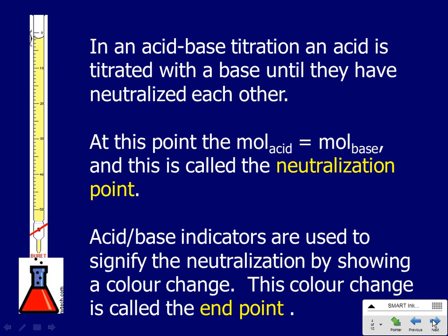Day two, we're going to take that sodium hydroxide that we now have standardized and calculated its concentration very well, and we're going to titrate that against some vinegar to see if the vinegar companies are actually putting 5% vinegar in their vinegar containers. We're going to actually be able to titrate and figure out the concentration of the vinegar and compare it to that.